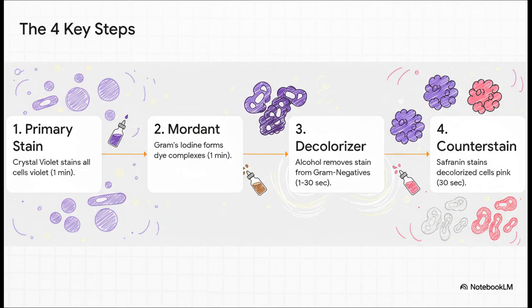Step 3, here comes the all-important decolorizer, but only for a few seconds. And finally, step 4, you add safranin, the counterstain. This is what gives those now colorless gram-negative bacteria their nice pink or red color.